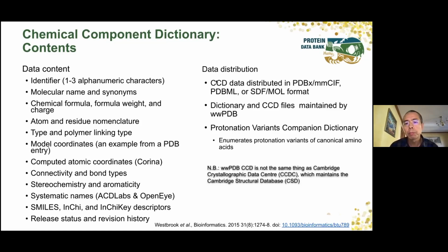In terms of data format, as Ezra said, the CCD data is primarily annotated in the PDBx/mmCIF format, but we also provide other format distributions such as PDBML and SDF. I want to stress that there's only one CCD that is maintained by all the PDB partners. And this CCD is different from the Cambridge Structural Database that is maintained by CCDC.